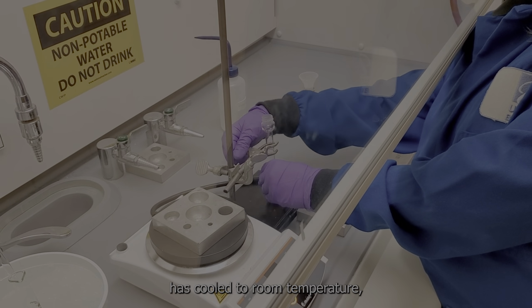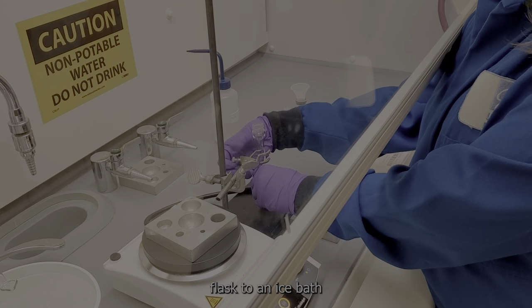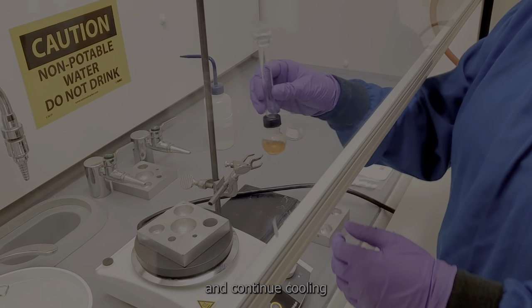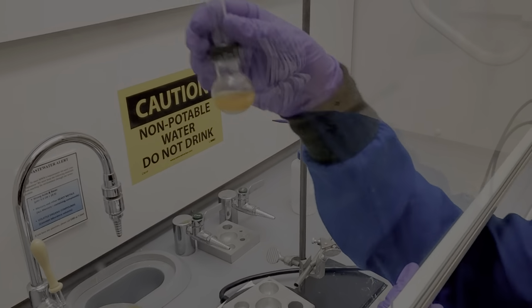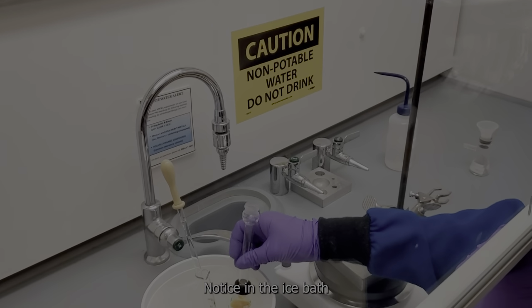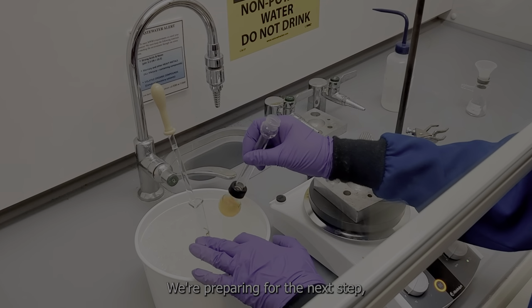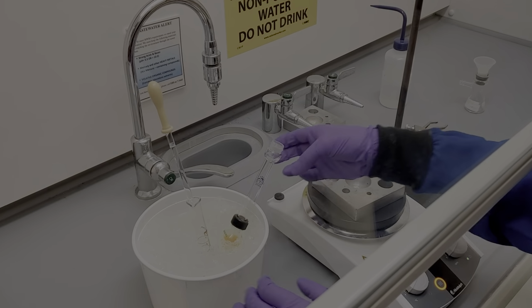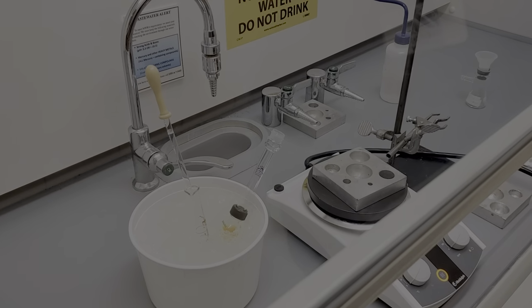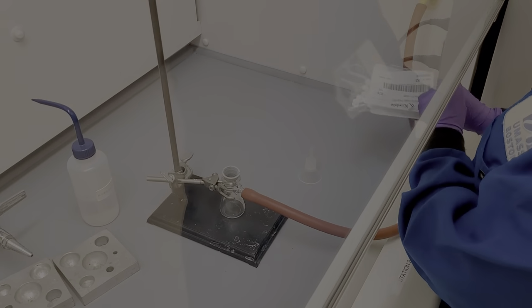Now that the reaction has cooled to room temperature, we're going to move the flask to an ice bath and continue cooling for an additional 10 minutes. You can see the crystals. Notice in the ice bath, we also have ethanol. We're preparing for the next step, which is going to be washing the isolated solid with ice cold ethanol to remove any absorbed pyridinium salts.